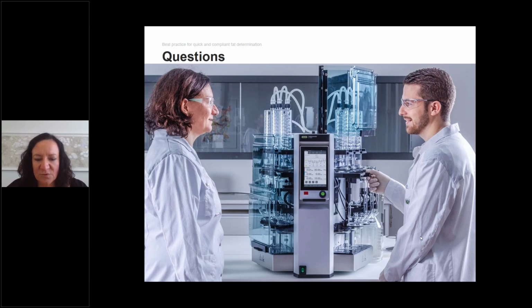We actually recommend to add the analyte protection sensor for Soxhlet and for ECE instruments, because they have long extraction processes. So whenever there's a leakage or there was an error in adding solvent, this will be detected by the analyte protection sensor, and then the instrument will give you an error message. You have the chance to refill solvent and restart the extraction process.